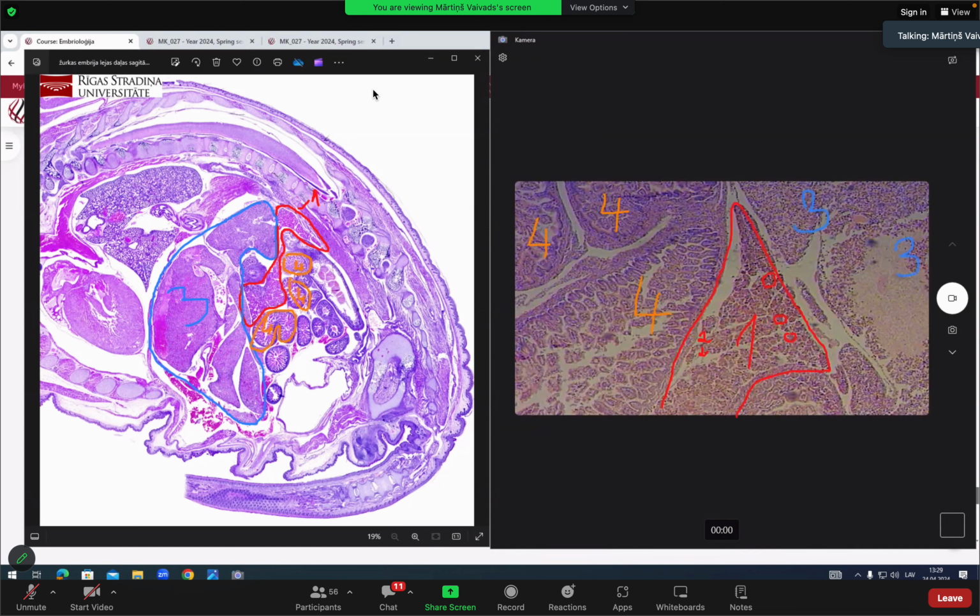In humans, I showed you how the pancreas could look like, glandular tissue growing in mesenchyme. Pancreas can appear in other slides, like this physiological herniation of the midgut. There's also separate slides, and I will show you a separate picture. We still have a lot of slides to check, but that's the idea here. You need to focus on these areas. About other organs, we will talk about during next class. So there's quite a lot of organs we need to check separately.